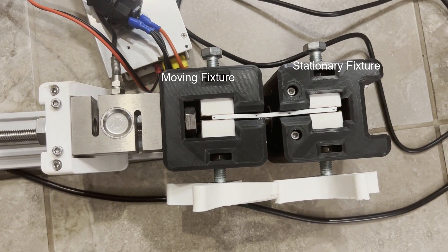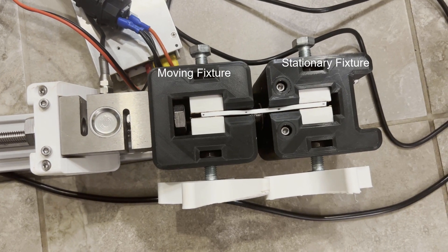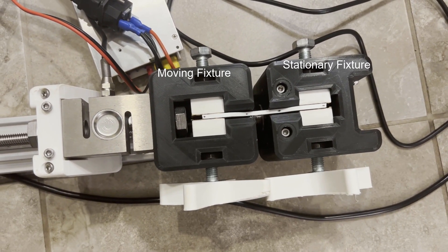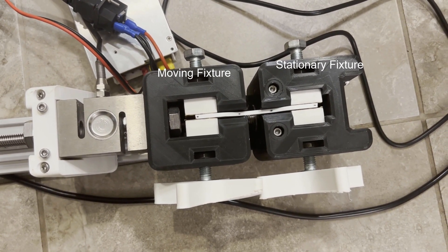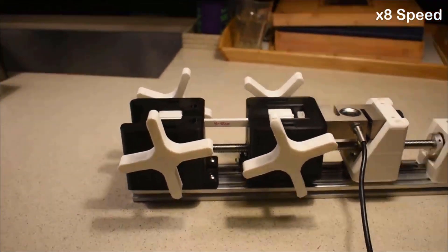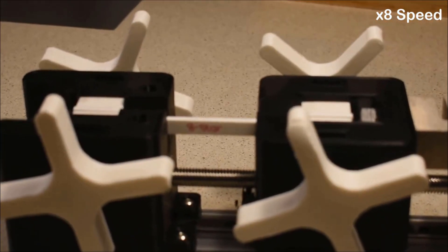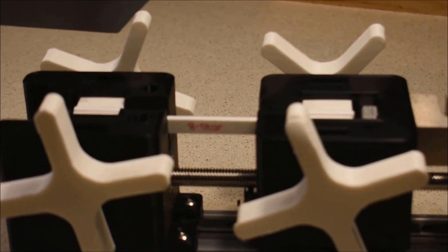To measure stress, the machine uses two fixtures — one moving and one stationary — each attaching to one end of the specimen. Once the machine starts, the plastic specimen is put under increasing stress. In turn, as per Newton's third law, for every force applied there is an equal and opposite force.